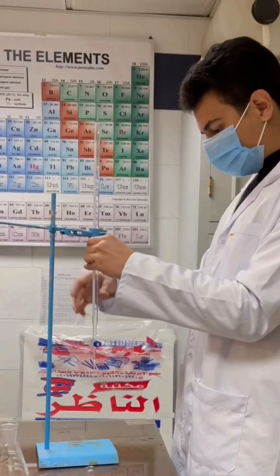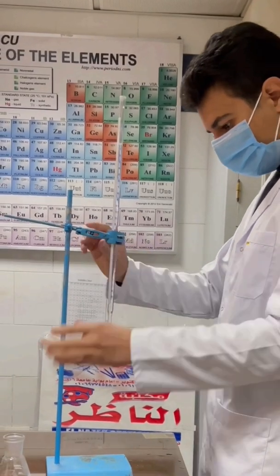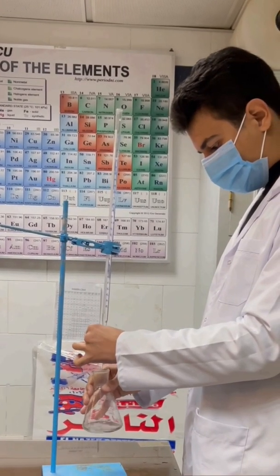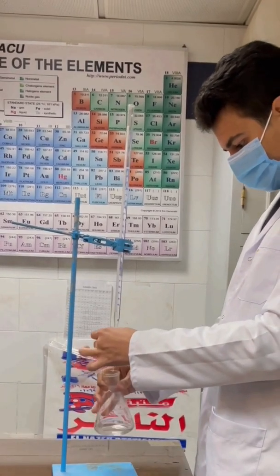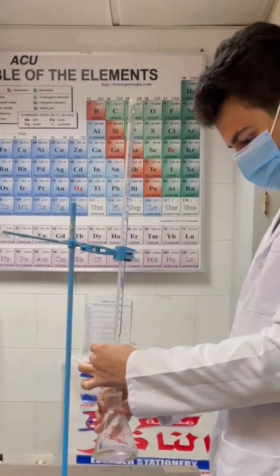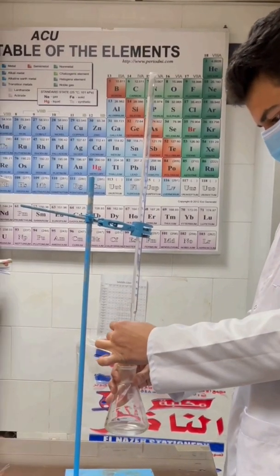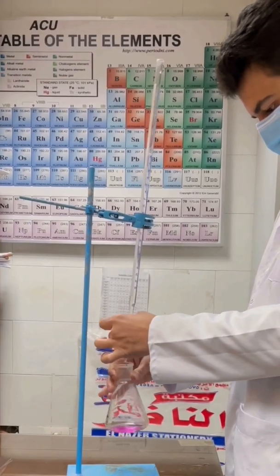Then we titrate till the first persistent pink color, and the endpoint should equal 10 since the titrant volume should be equal to the sample's volume, since solutions with equal normalities react together with equal volume, and there are both strong base and strong acid. Here we have the pink color.